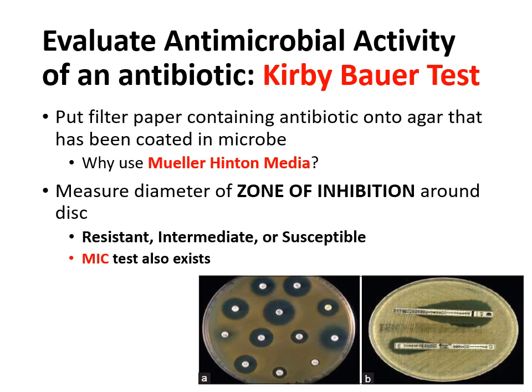If that bacterium is susceptible to that antibiotic, you will see a very big zone of inhibition, such as the one right here, because that bacteria is susceptible to getting killed. It's able to be killed by that particular antibiotic.